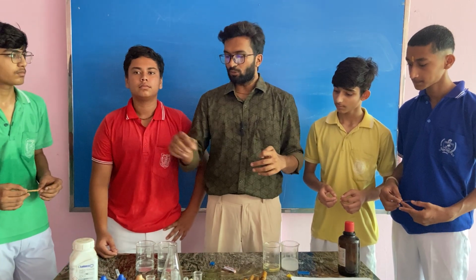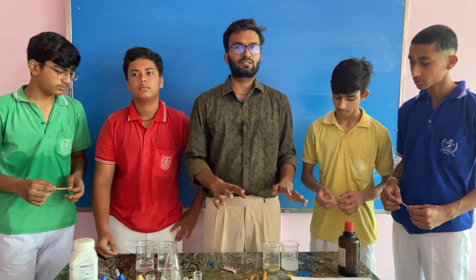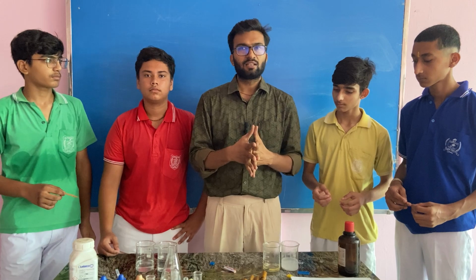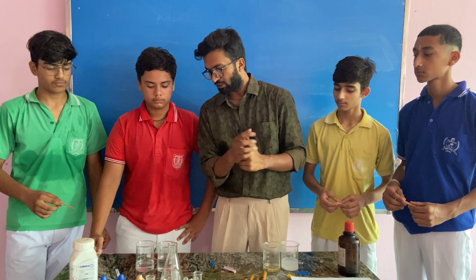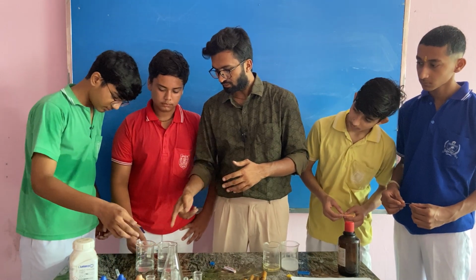We are going to dip it in the solutions and it will change the color, and after that we will tell the pH or the nature of the substance according to the color. Okay, now start. Do it.